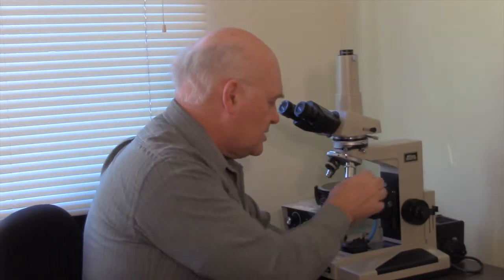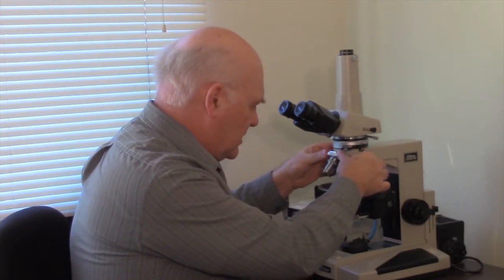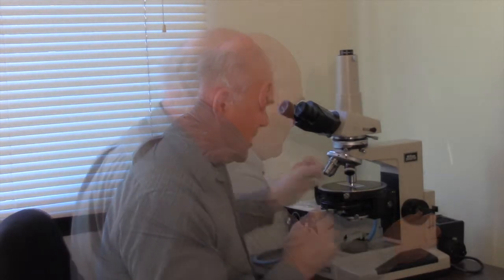So as we look at these pollens, we'll need to go to the 40x objective to more thoroughly characterize them. There's another feature that comes out in these grains if we use a different refractive index medium. The amount of detail that you can see is dependent upon the difference of refractive index between the mounting medium and the particle that you're looking at.